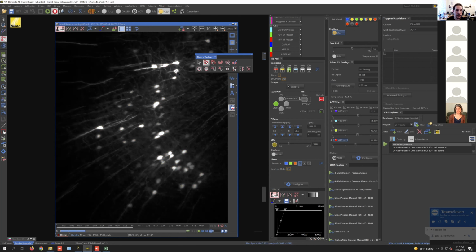And so it really doesn't take any more than half an hour to an hour to sit down and really carefully annotate 10 to 12 images. And I would use this single tool, or the single region tool, left click, and then I'm just scrolling with the mouse wheel to adjust that threshold locally, and then right click to mark that. And this is just one way of doing it. You could be more strict and just mark a center point for the cells if you're worried about touching objects.